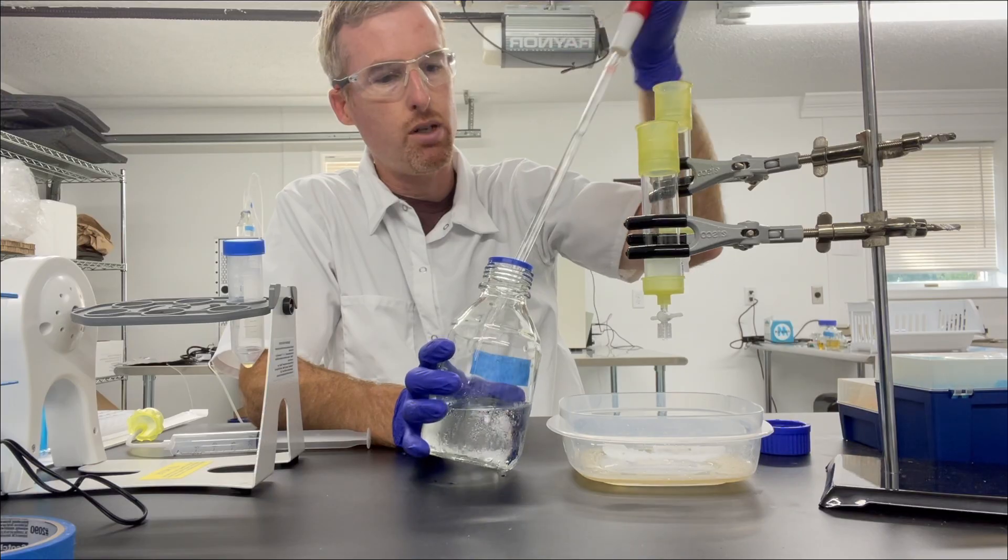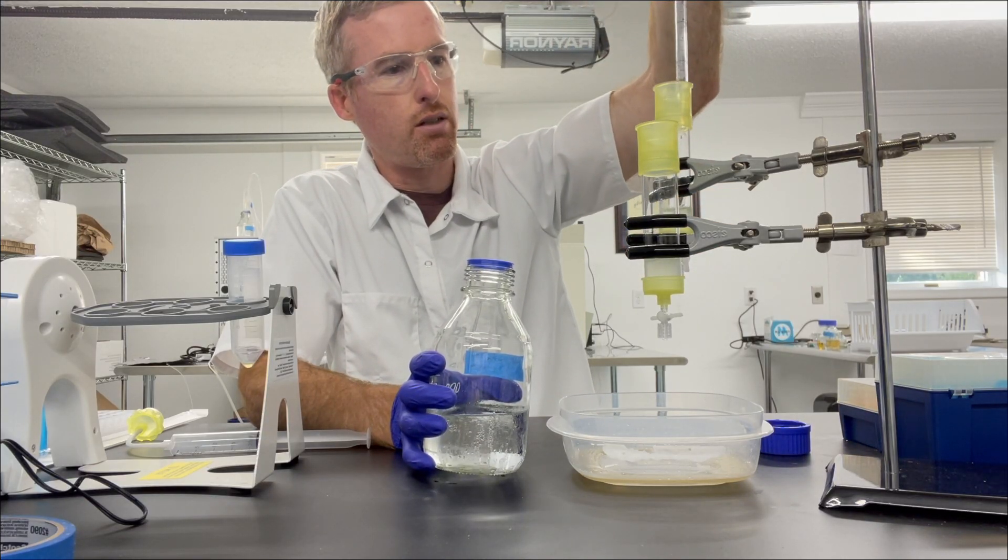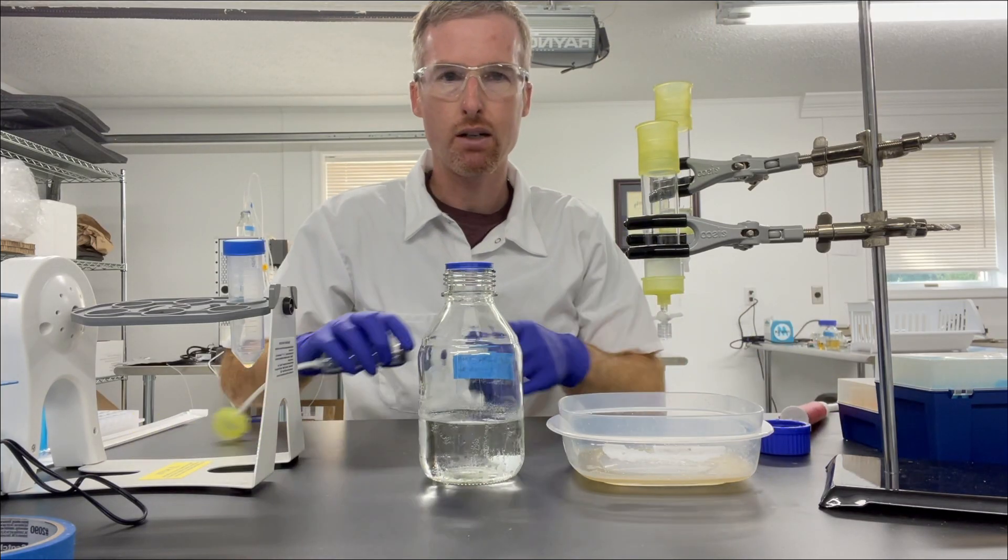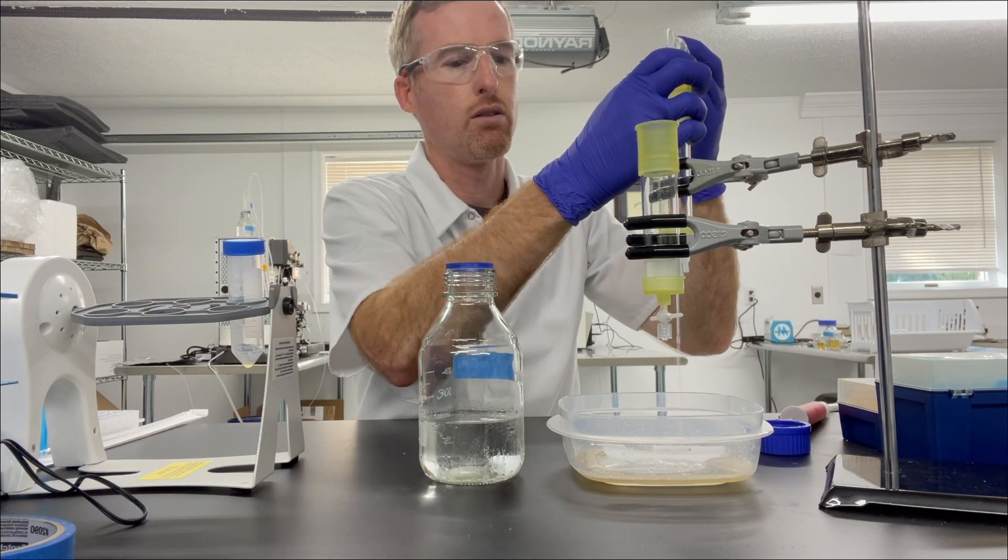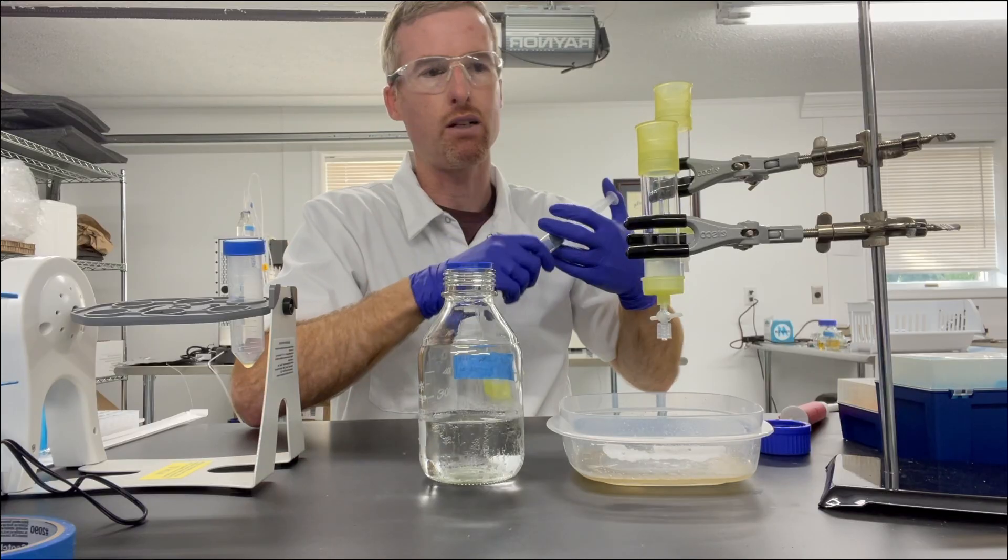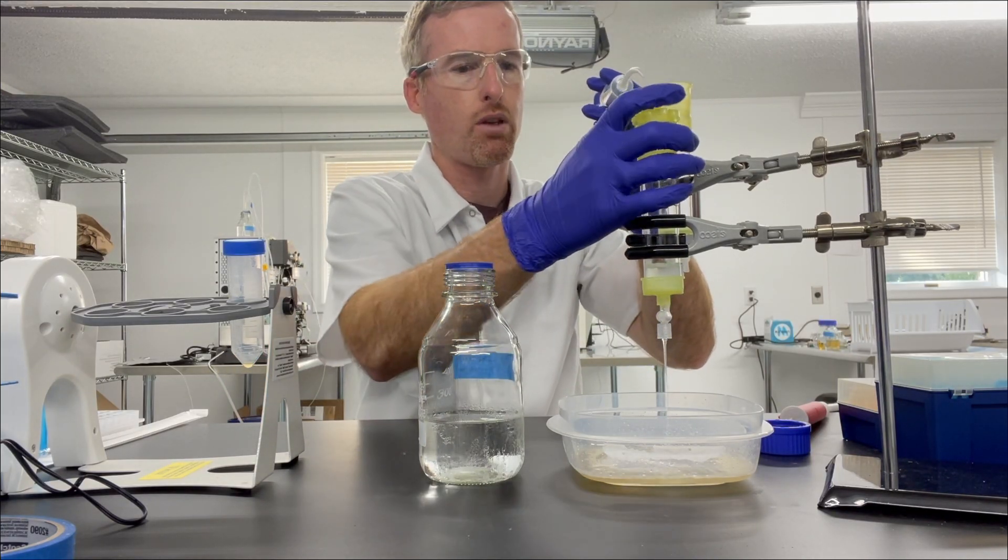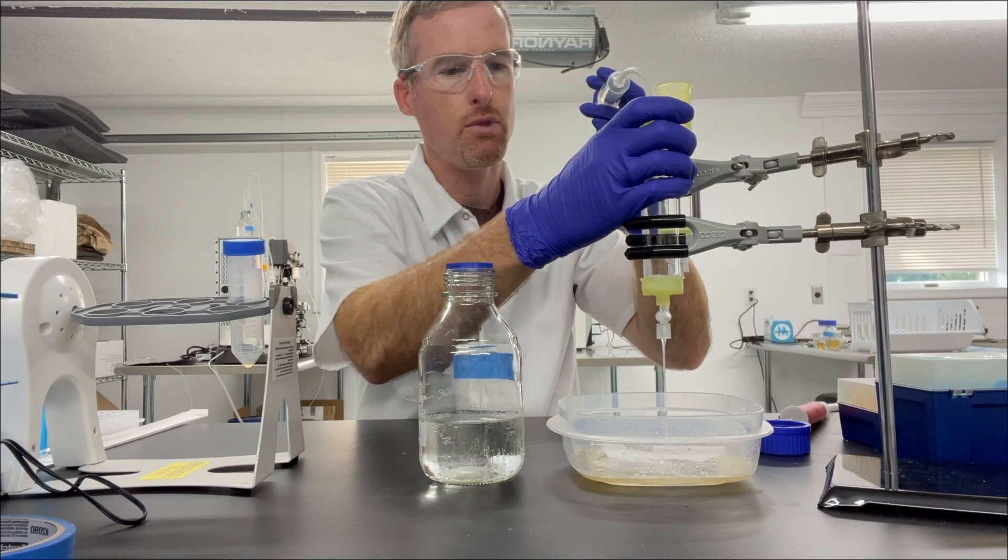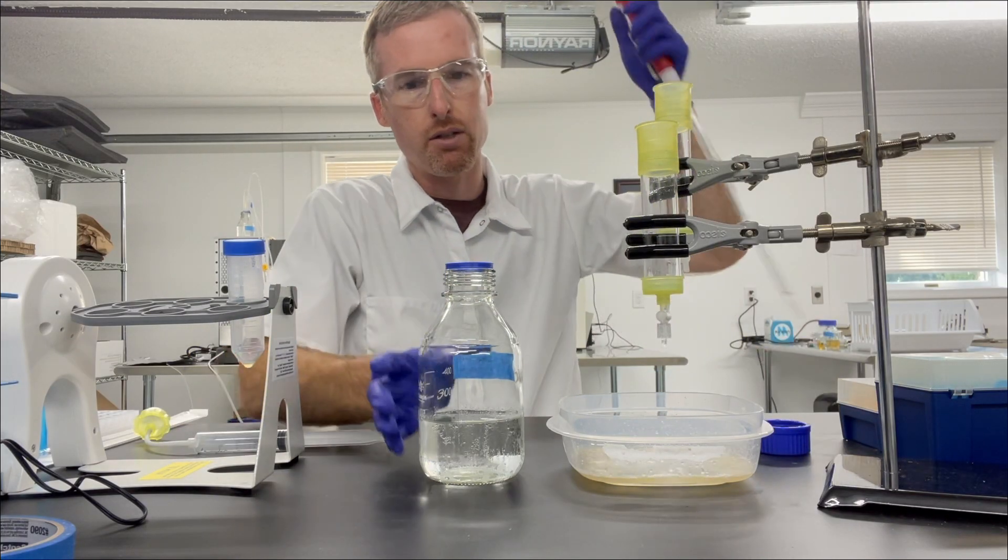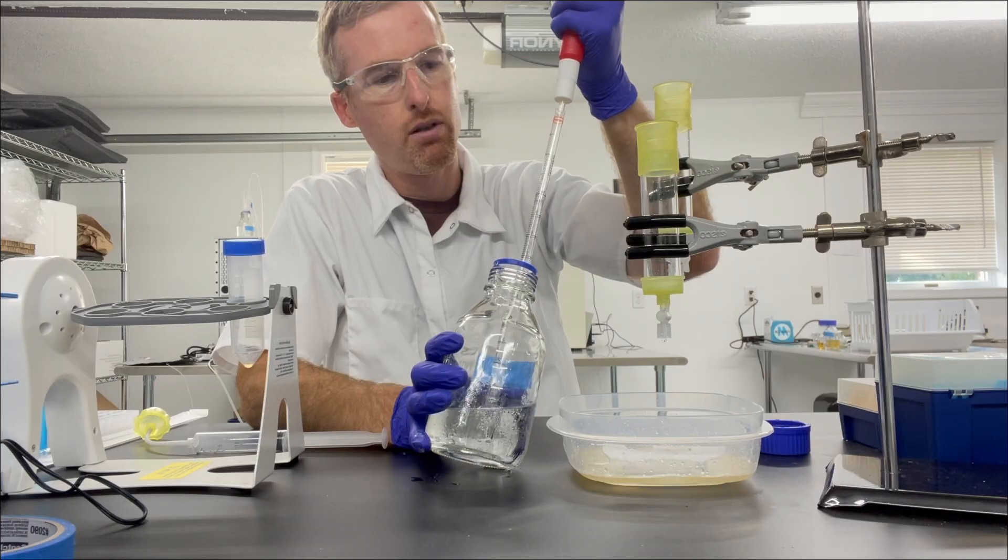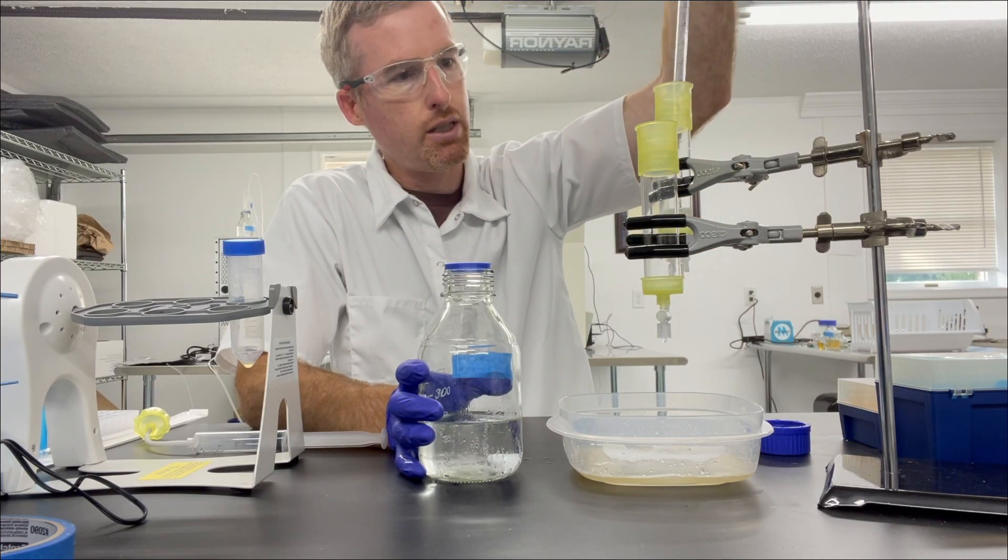So I do 10 ml washes. It depends on the size of your purification. I have 1 ml of nickel agarose, so I'm using 10 ml of wash. If you had 2 ml or, let's say, if you had about 5 ml of nickel agarose, then you would start using more like 20 ml of wash buffer at a time. But I'm doing 10 ml washes, and I'm going to repeat them 10 times.